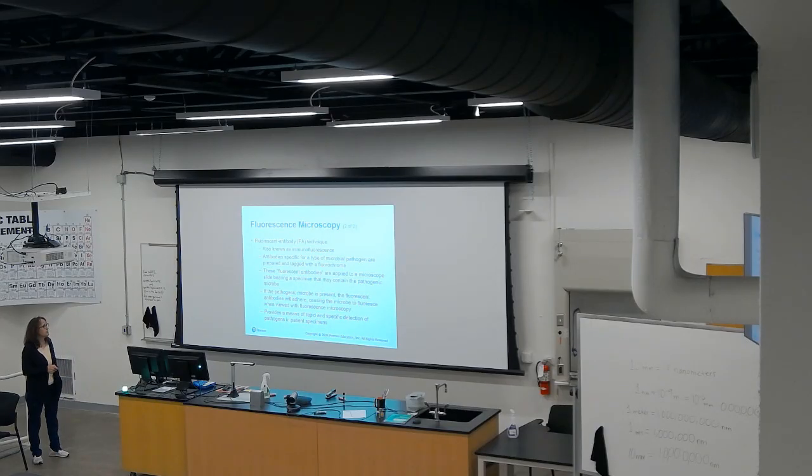So fluorescence antibody technique is also known as immunofluorescence. You don't necessarily need to use antibodies. Sometimes some objects naturally can be absorbing these fluorochromes. But when it comes to the surface of certain structures, including the plasma membrane, or even internally, like cytoskeleton or nucleus, and sometimes even DNA, it's very elegant what you can achieve with this technique.